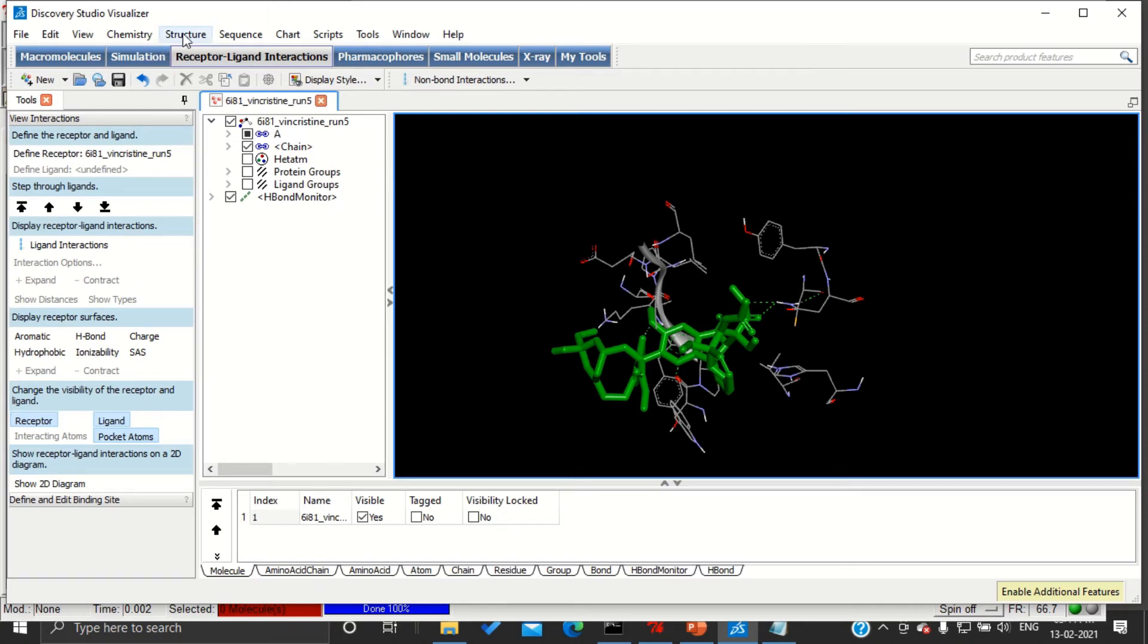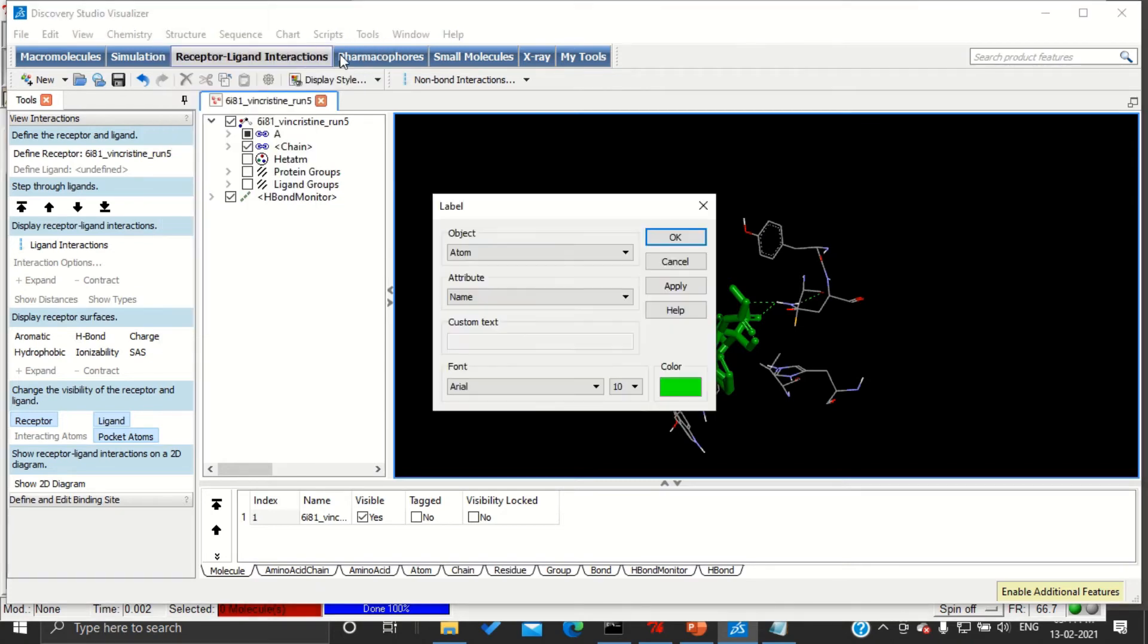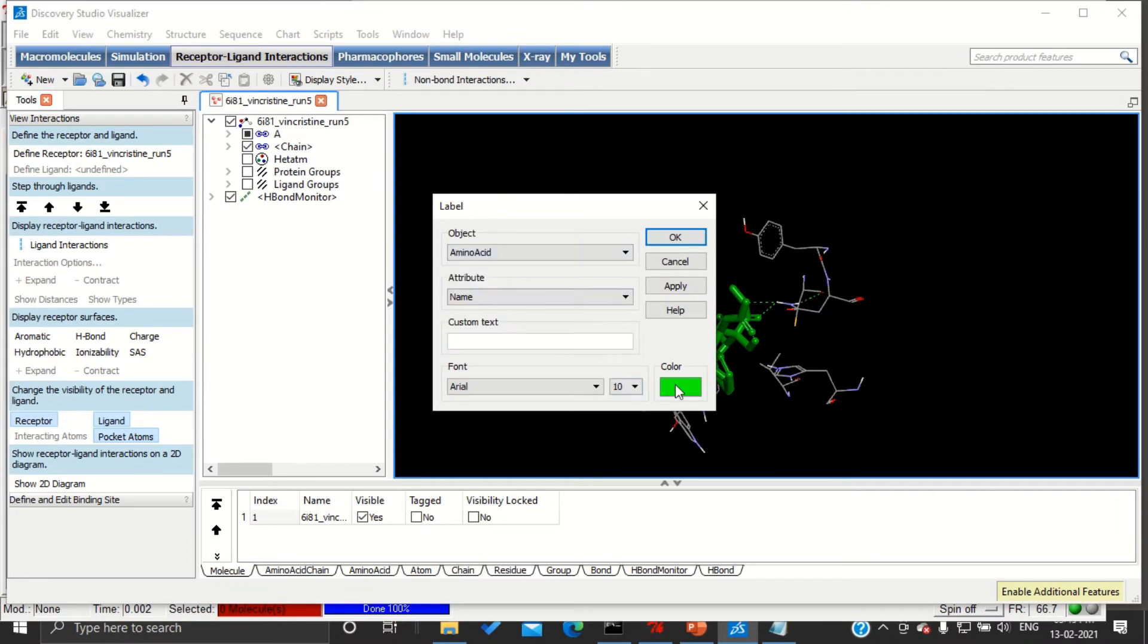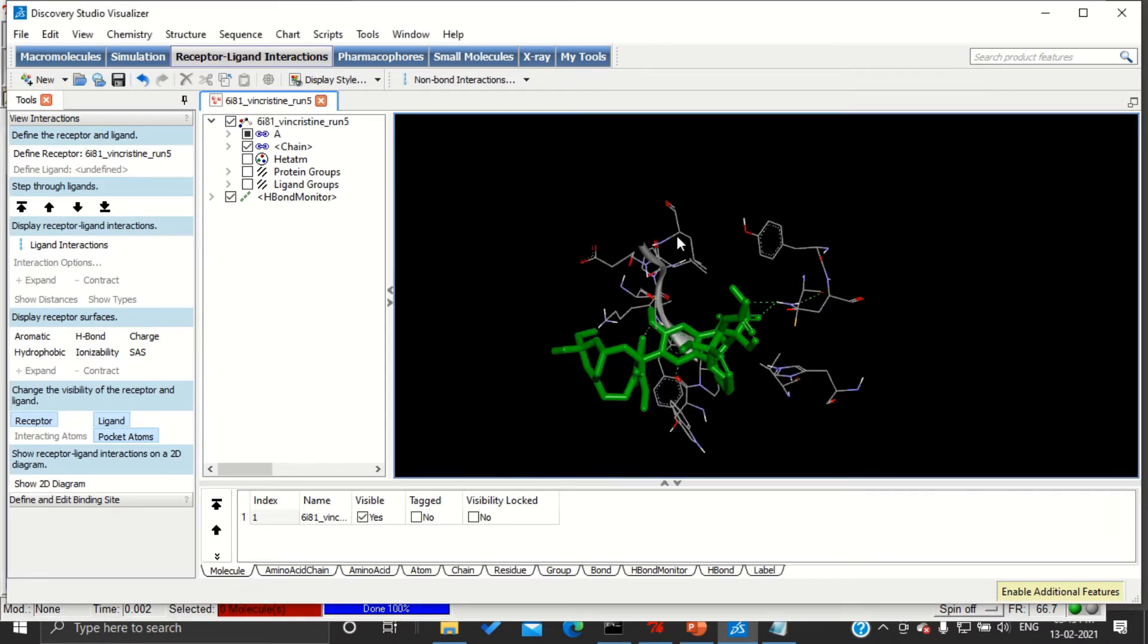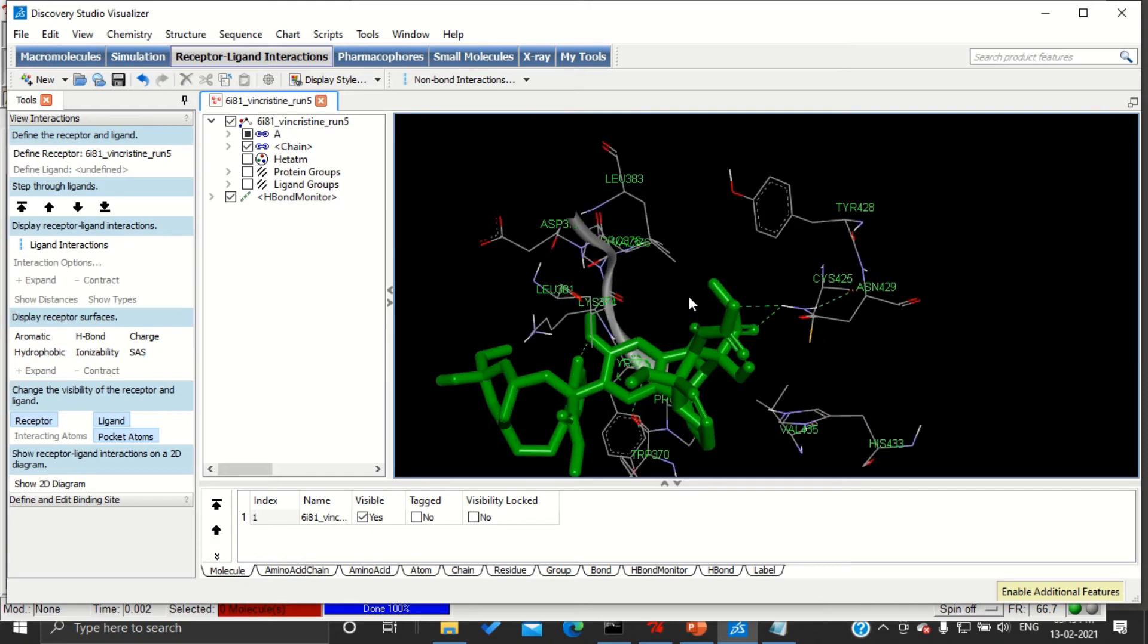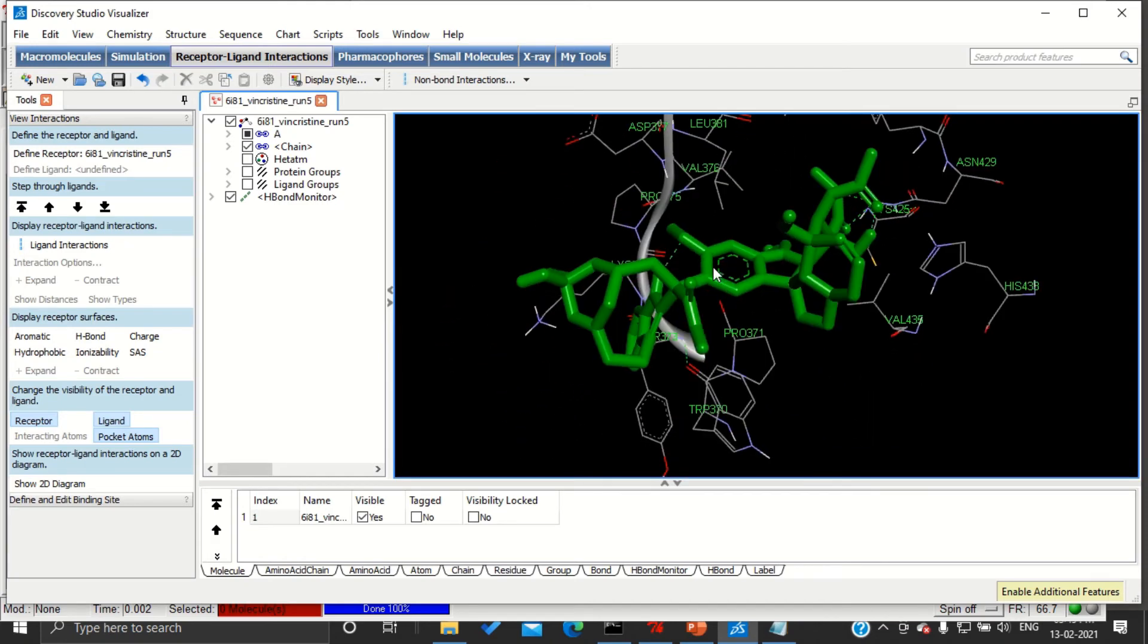If you want to label them, go to structure, label, add, and choose amino acid. Here you can see leucine of 383 sequence number is having some interaction with our ligand. If you want to see the 2D diagram, you can press show 2D diagram, where the 2D diagram will be generated.